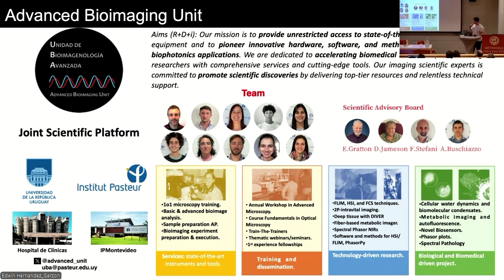We do service, microscopy training, bioimage analysis, sample preparation, bioimage experiment preparation. Then we have a training and dissemination part. We conduct some workshops and training and lectures, seminars. We have grants to do that, so we bring people from around Latin America to participate with us.